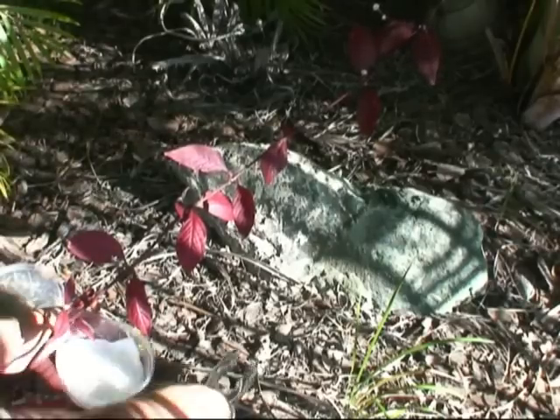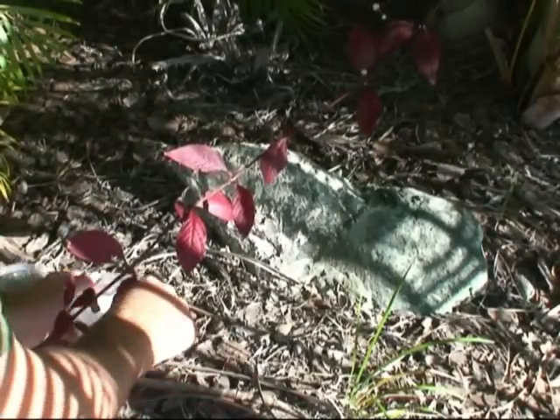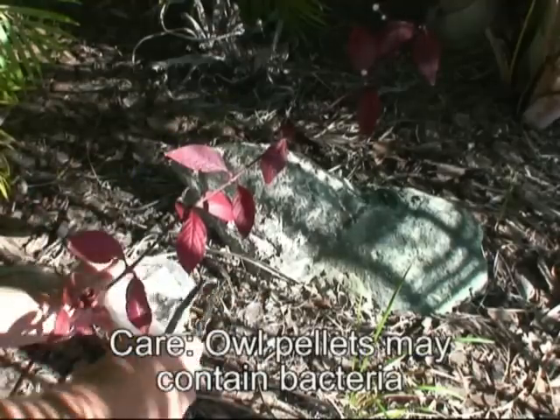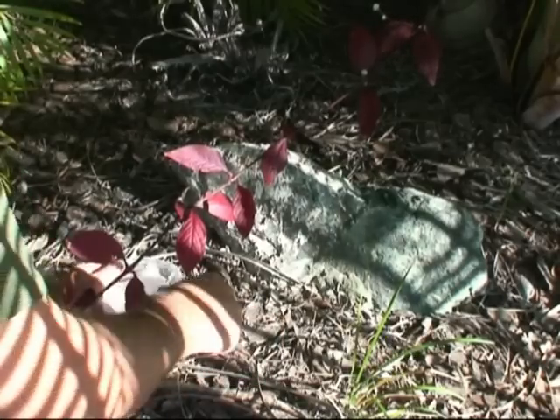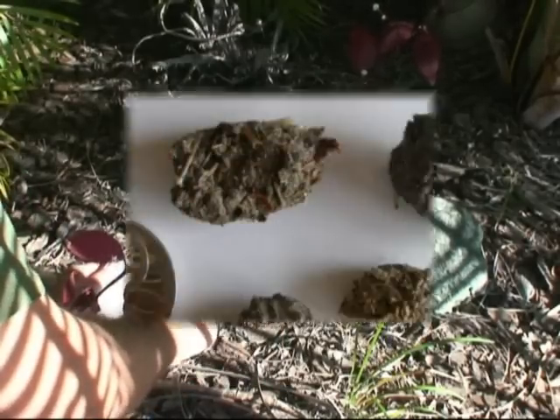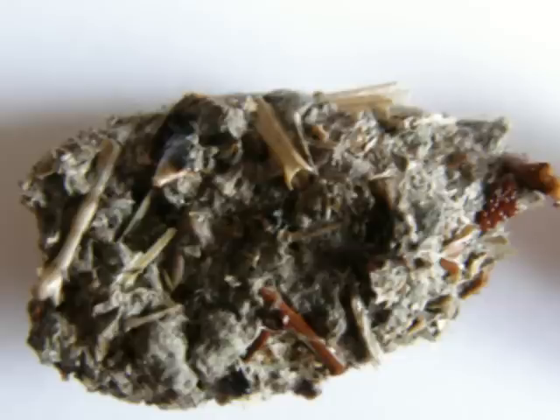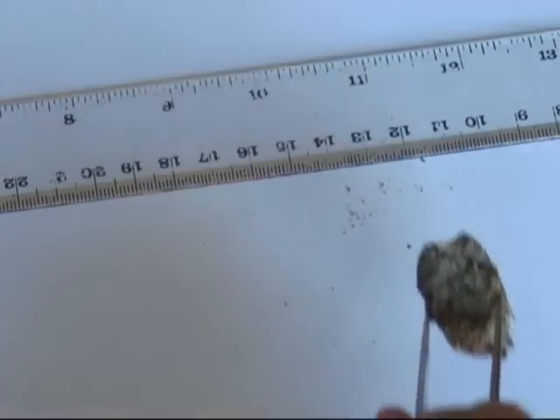We'll just pick these pellets up. Owl pellets may contain bacteria, so it's best to use tongs and place them directly into a sealable container.